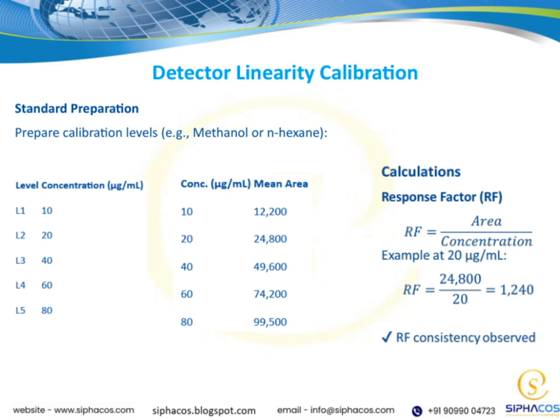Connecting this to the overall theme, proper standard preparation and linearity calibration underpin the accuracy and reliability of our entire analytical process. They ensure that our measurements are consistent and trustworthy, laying a solid foundation for meaningful results.